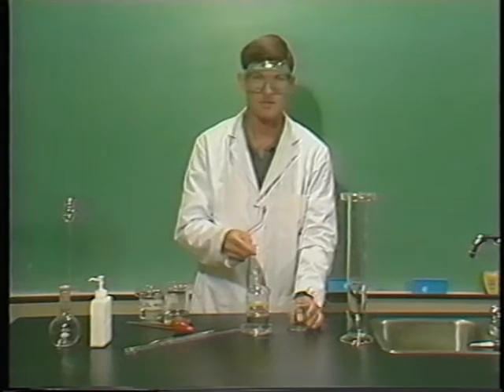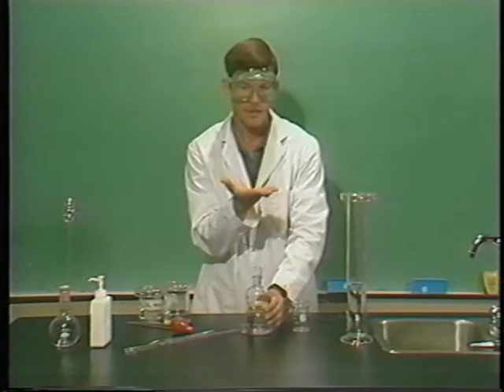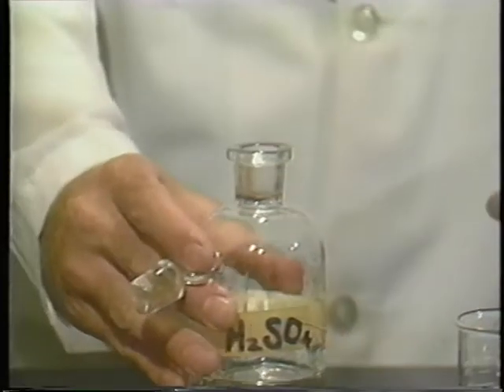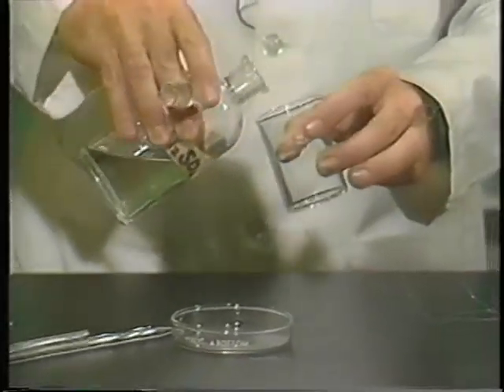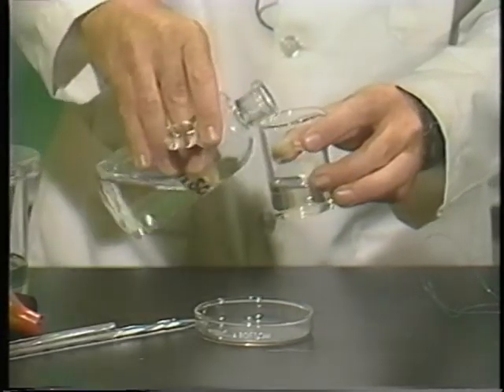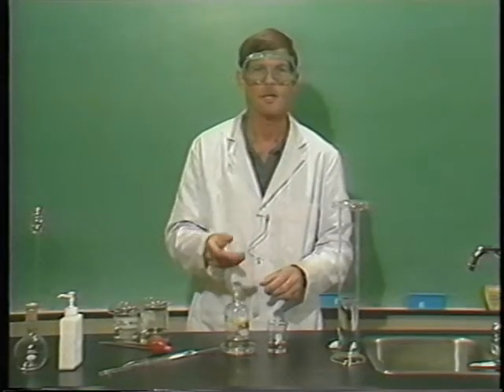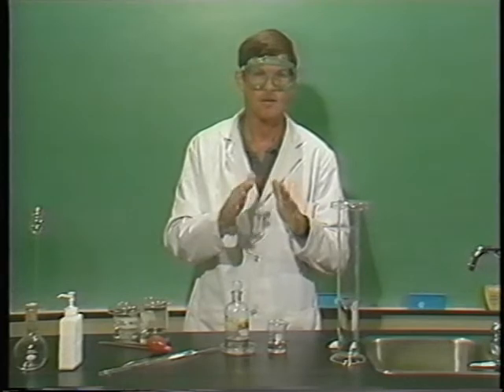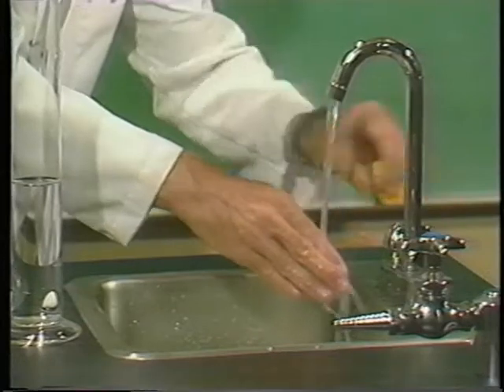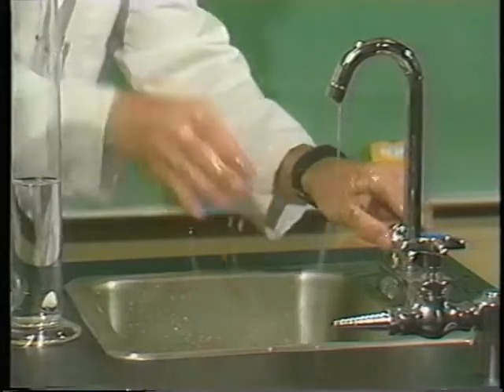The proper way to take the stopper out is to grasp the bottle firmly with one hand, turn your hand upside down, and between these two fingers, reach in and remove the stopper. You will then be able to lift the reagent bottle up and carefully and slowly pour the acid into the beaker. Make sure once again that you hold it over the Petri dish in case there are any spills. Once you've reinserted the glass stopper, it's always a good practice to wash your hands off, because you might have picked some acid up on the back of your hand when you pulled that stopper out. And in fact, I'm starting to feel a little stinging sensation on the back of these two fingers, so I might have gotten a little bit of acid on them.